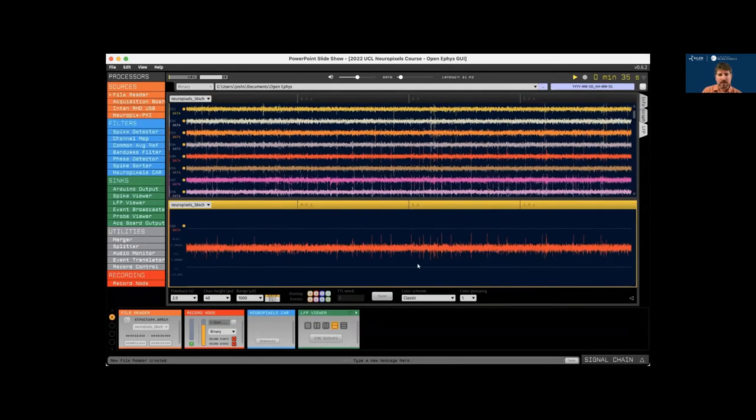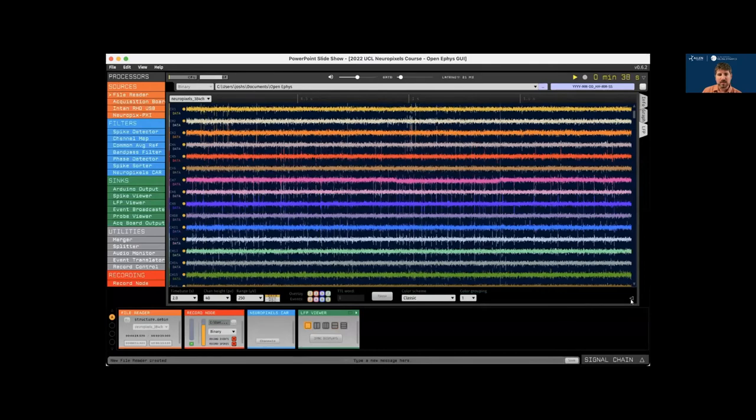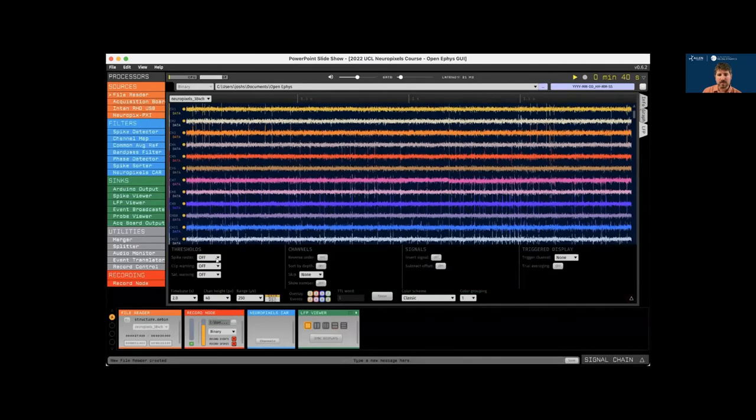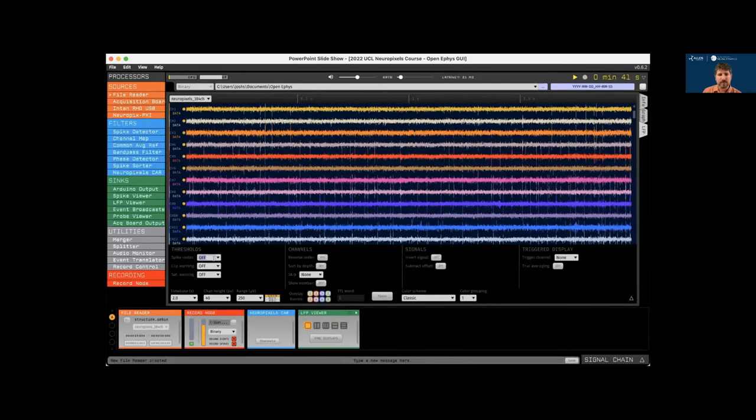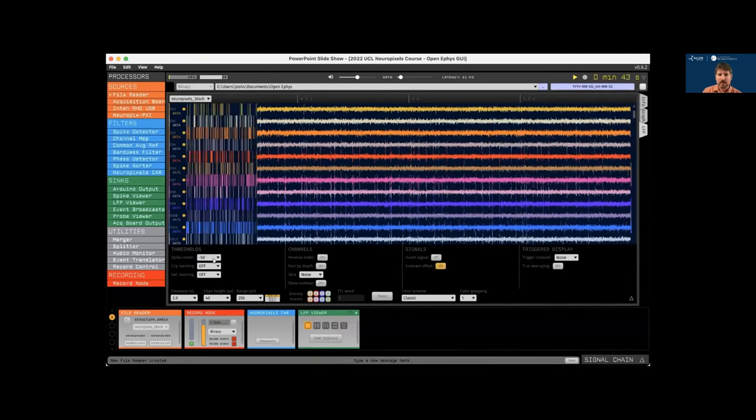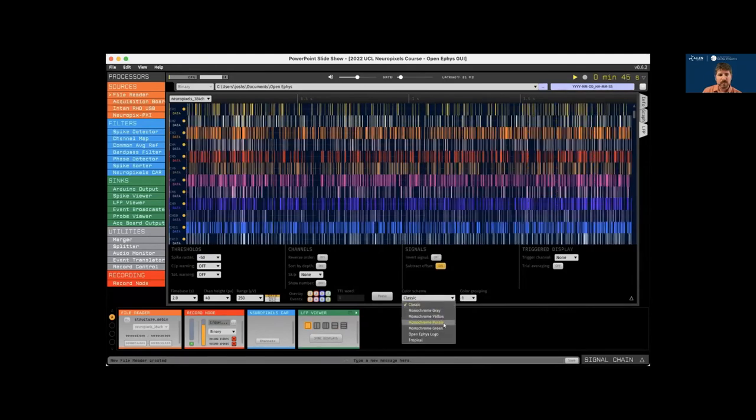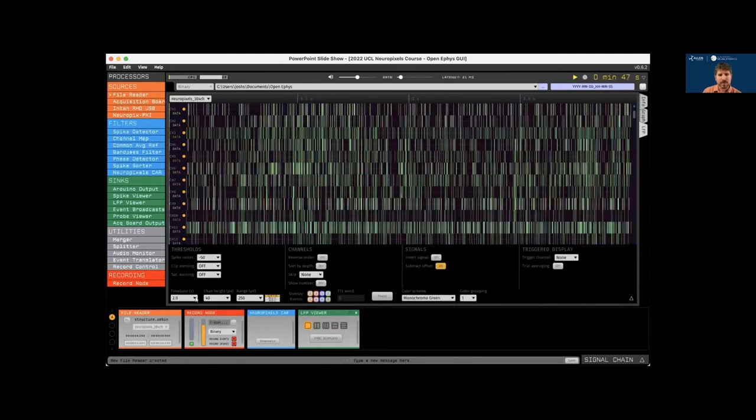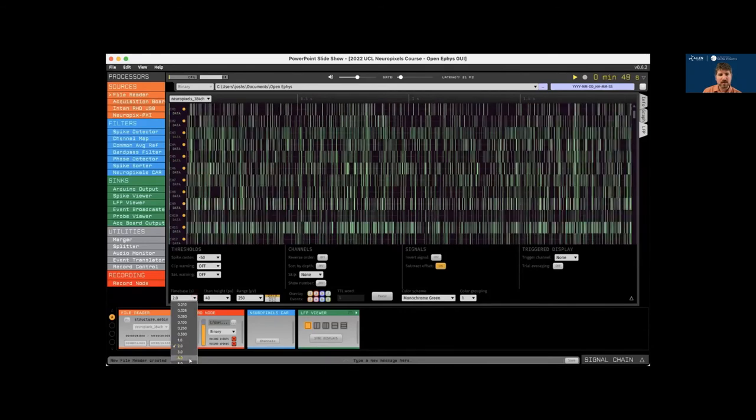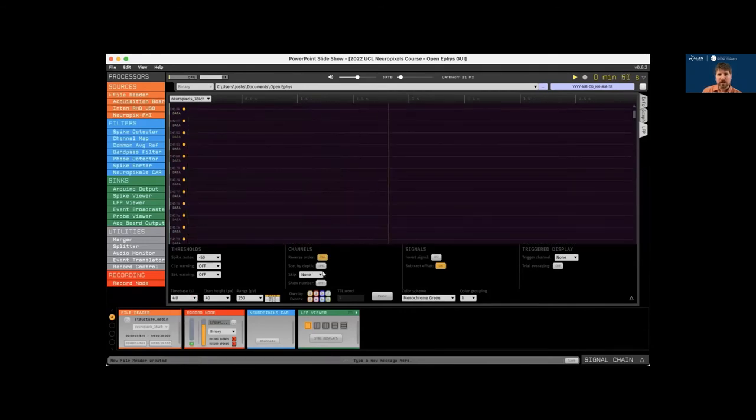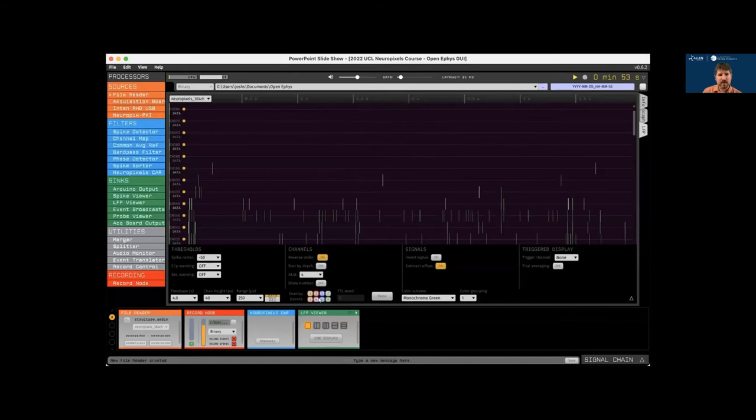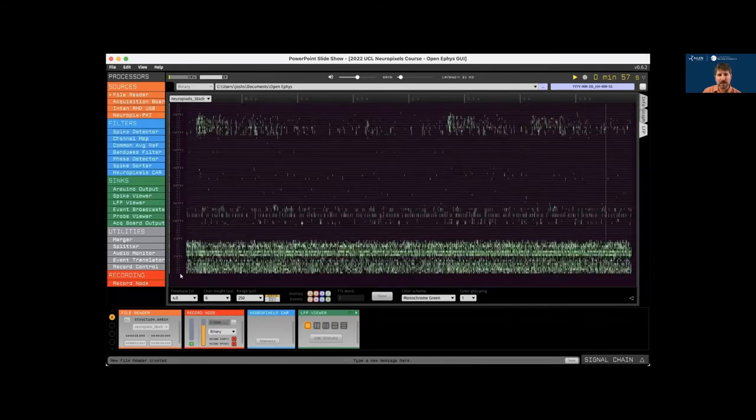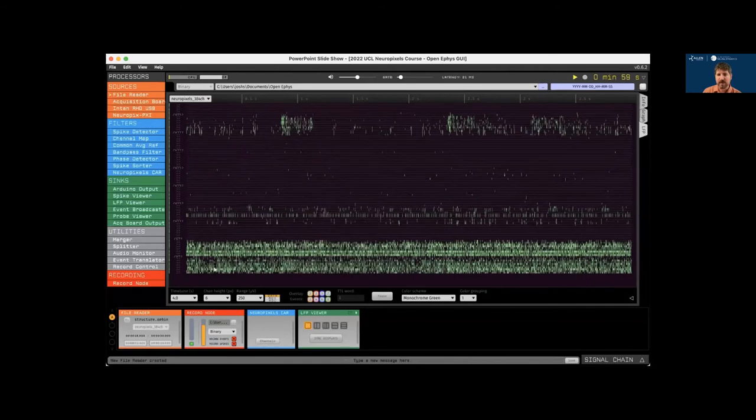And then let's change the display into spike raster mode by first setting a threshold of minus 50 microvolts, then changing color scheme to monochrome, changing the time base to four seconds, reversing the channel order, skipping every fourth channel, and then changing the channel height to six pixels. And now we can visualize spikes across the entire length of the probe as a raster.